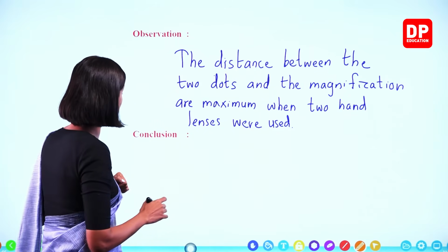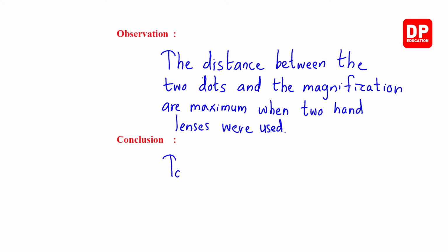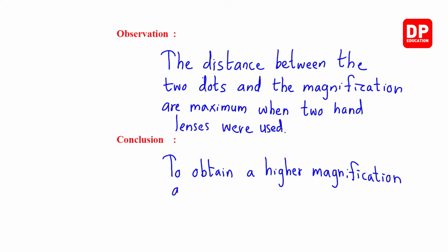So what is the conclusion? To obtain a higher magnification and resolution, resolving power.